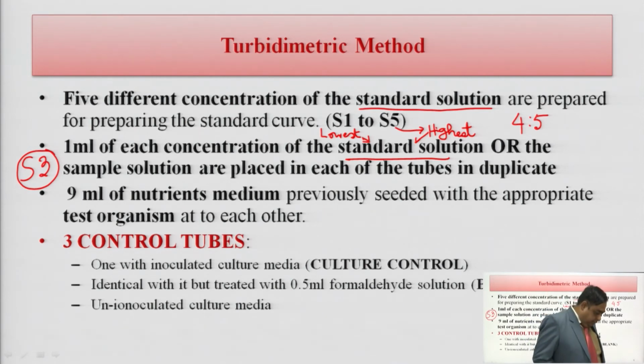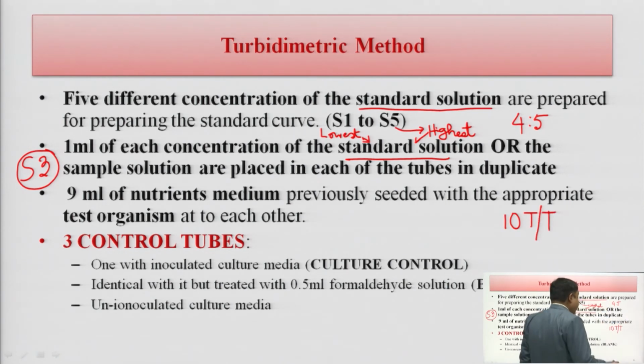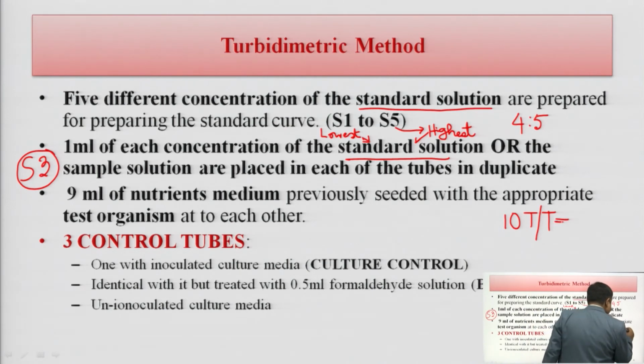Now, you have a total of 10 test tubes where you have 1 ml of standard solutions, either S1, S2, S3, S4 or S5.